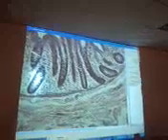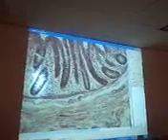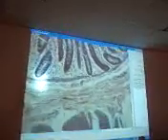This is lamina propria. And you go down to here, what should this be? Muscularis mucosae. So it's muscularis mucosa. And then I get into this area and I'm into a region that's a submucosa. There's a submucosa here, which should be kind of that dense, irregular looking kind of tissue, connective tissue.